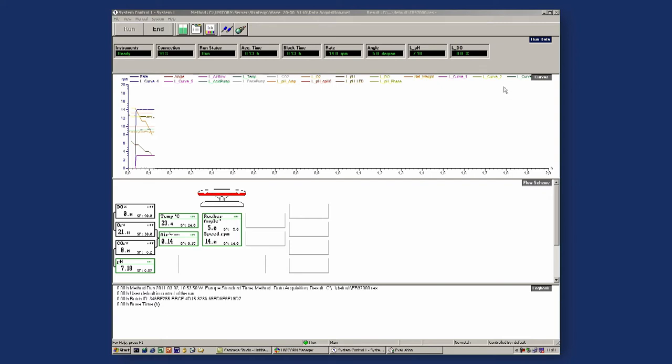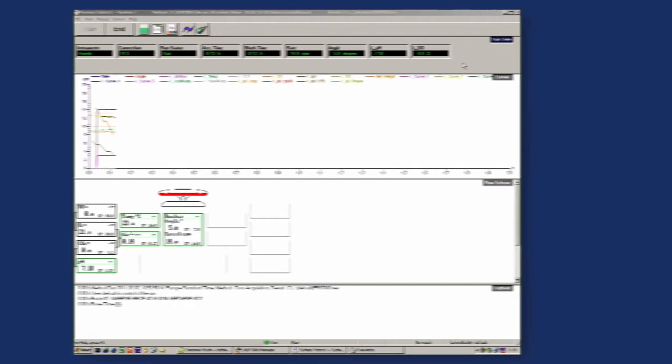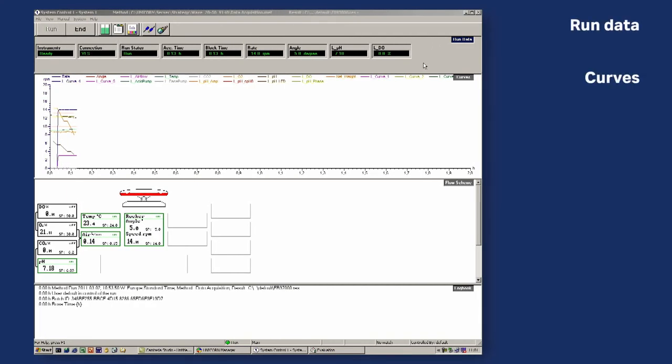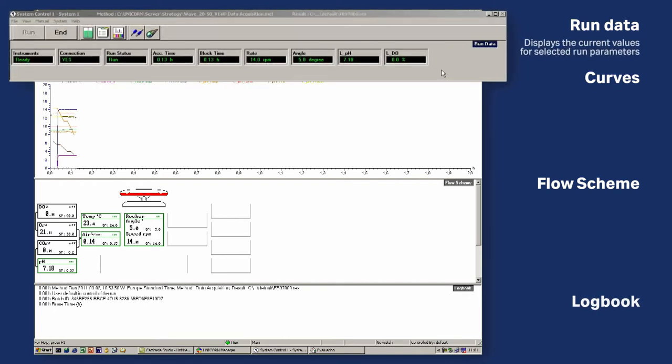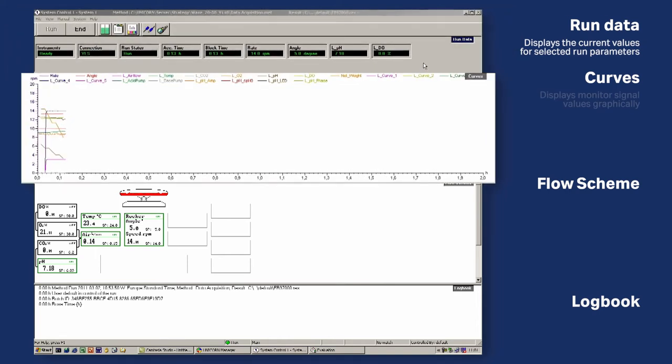The System Control module displays the status of the current system. The four panes - Run Data, Curves, Flow Scheme, and Logbook - can be viewed simultaneously. The Run Data pane displays the current values for the selected run parameters. The Curves pane displays monitor signal values graphically.